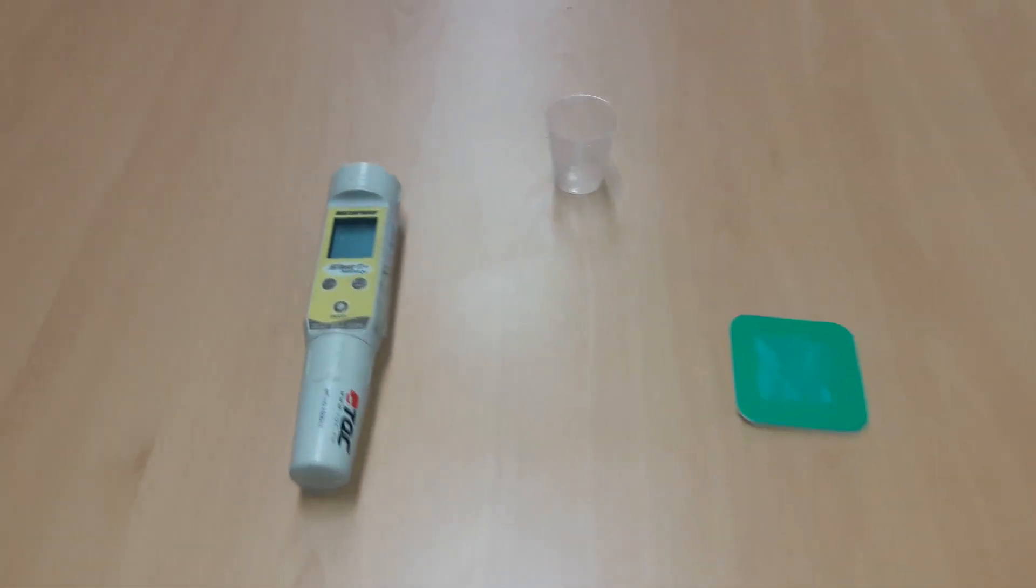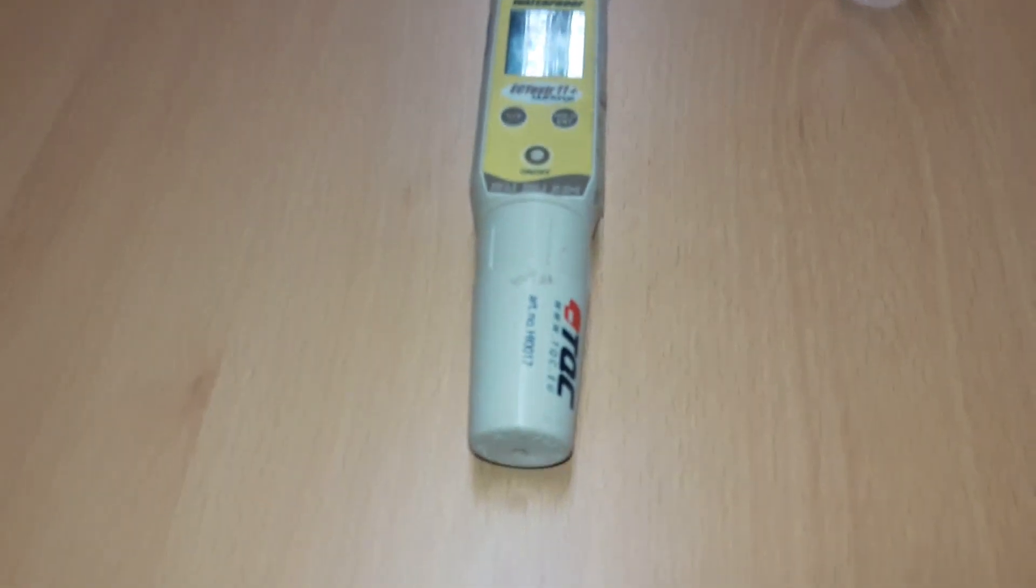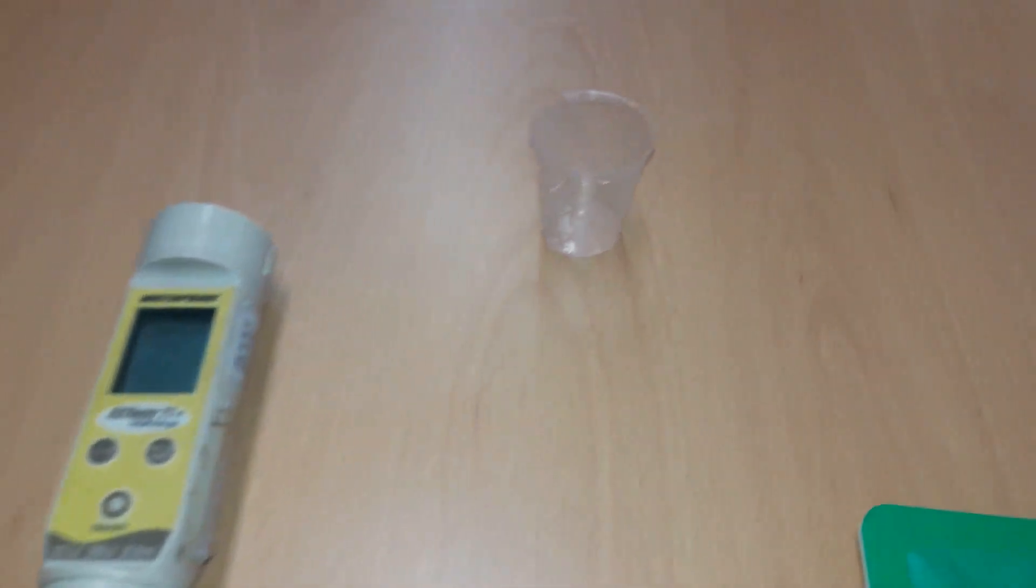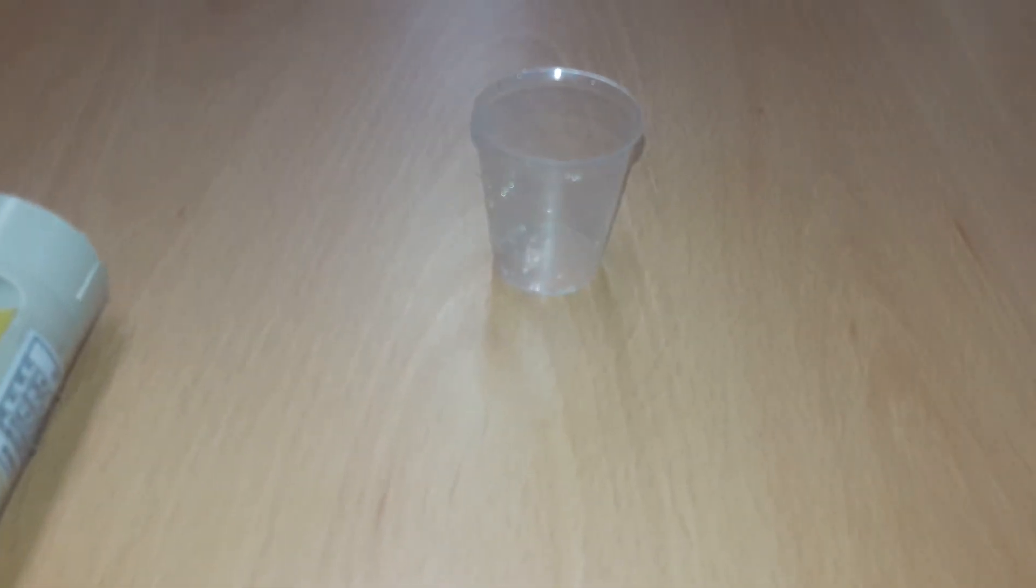Apparatus and Materials: Conductometer. Beaker, a convenient size and shape for housing the electrode end of the conductometer during measurement.